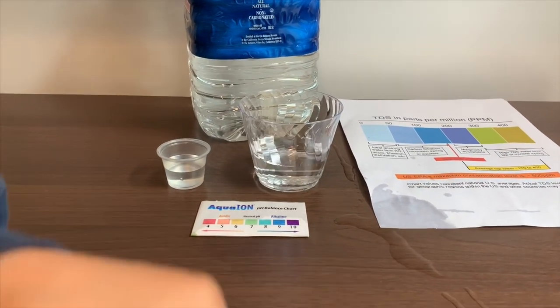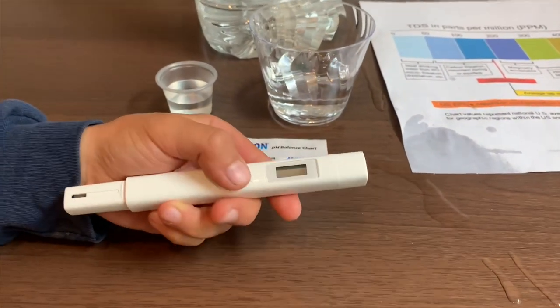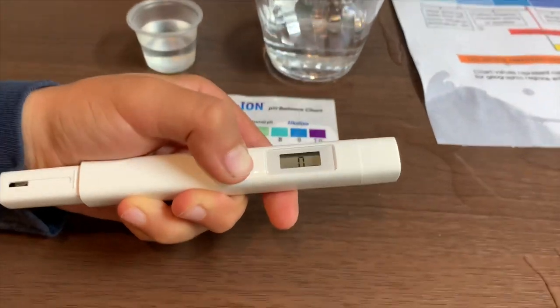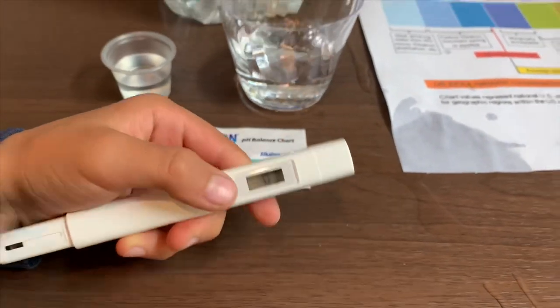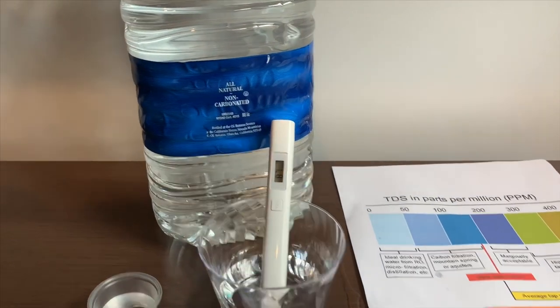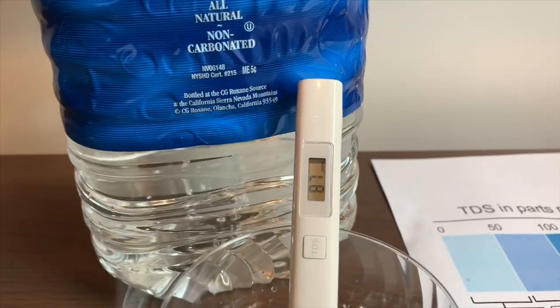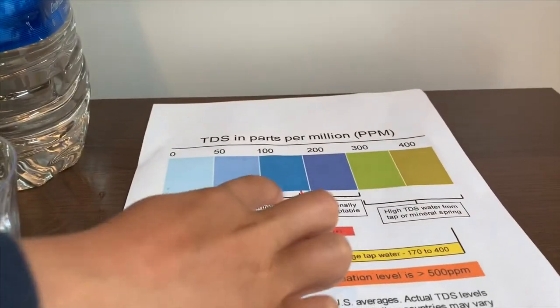First, let's test the TDS level. If you want to buy this TDS tester, check the link down below. Turn on the TDS tester, make sure it says 0, and put it in. The reading is 87. That is okay to drink.